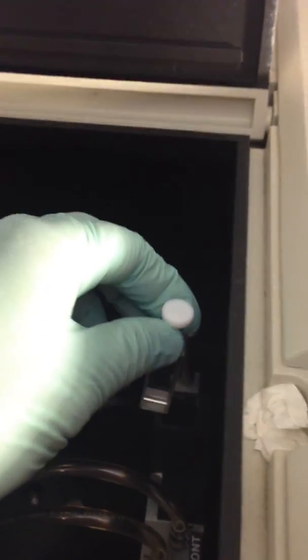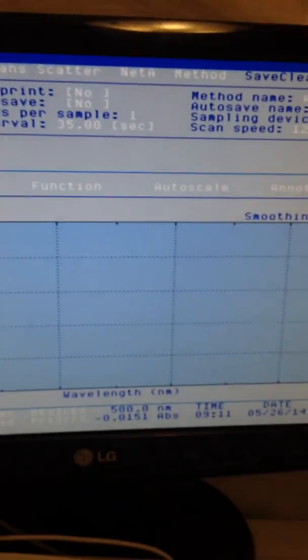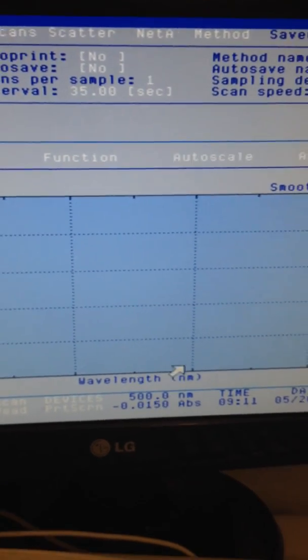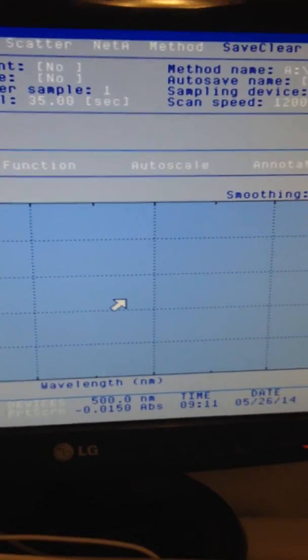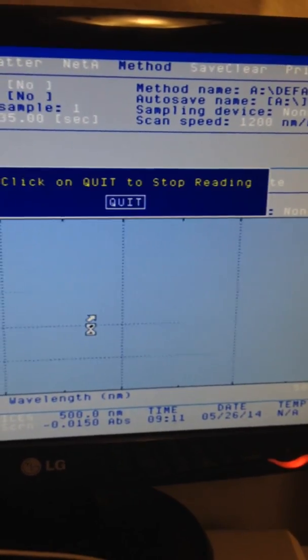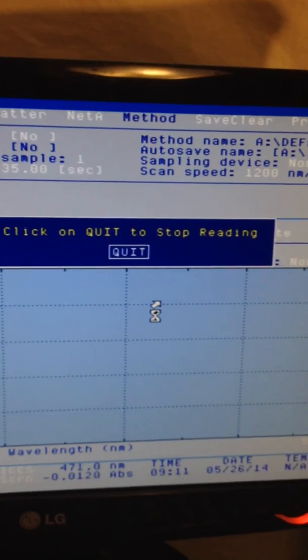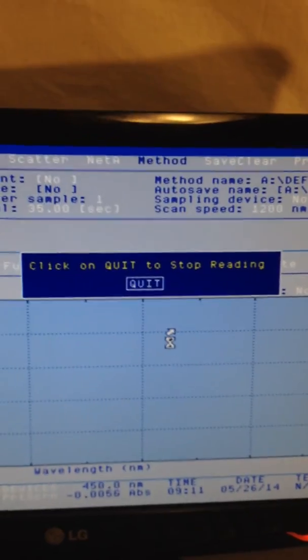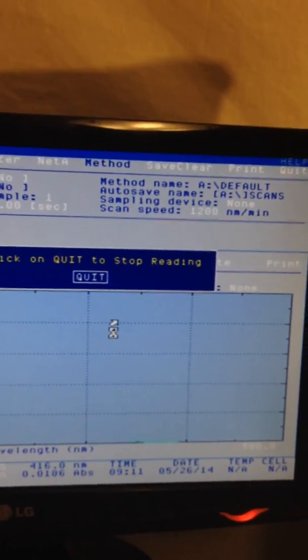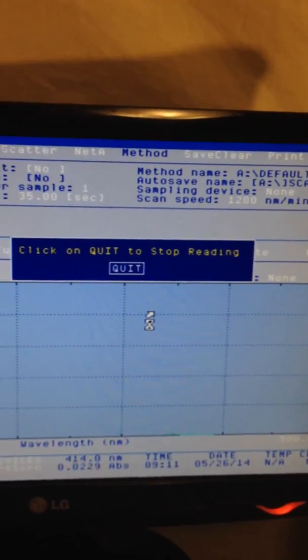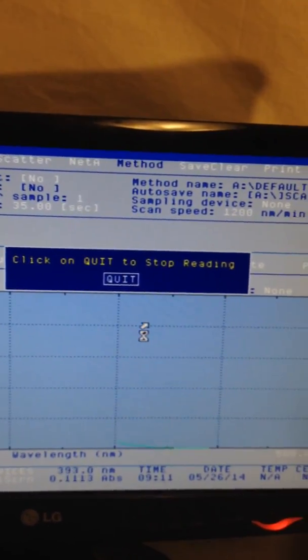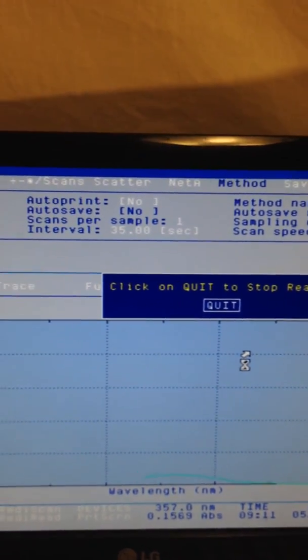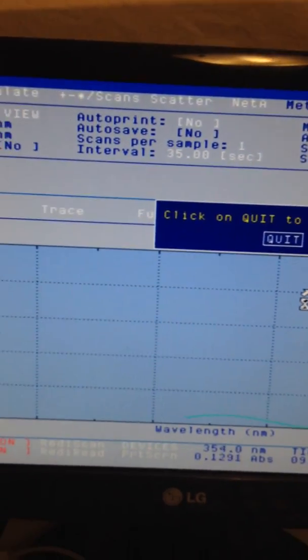Place it in the instrument and close the lid. Right click on the mouse to start measuring the absorbance. You can measure absorbance or transmittance, it's up to you. This is a very dilute solution.